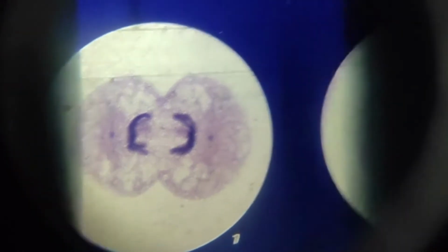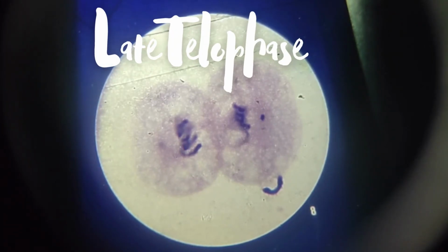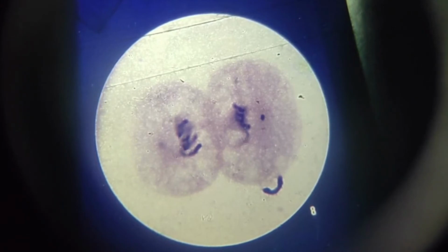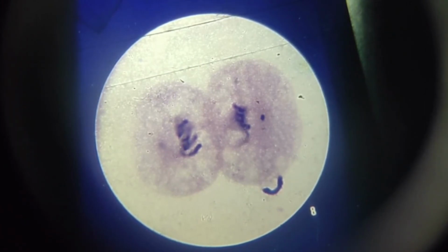And now let's go to the last slide. This is now the late telophase. The separation is now completed. The original zygote of the Ascaris has divided to form two daughter cells. Each of these two cells has 4 chromosomes. The chromosomes in each cell will soon lose their clarity. They will become long and thin and not so distinct. Then the process of mitosis will start again in each of the 2 daughter cells. The result will be 4 cells, and these in turn will start the process of cell division of mitosis again.